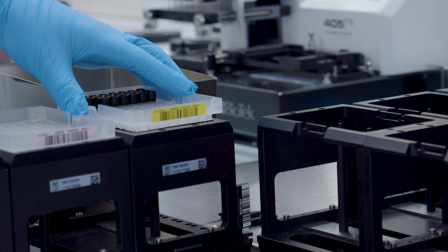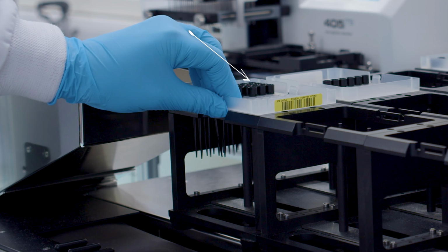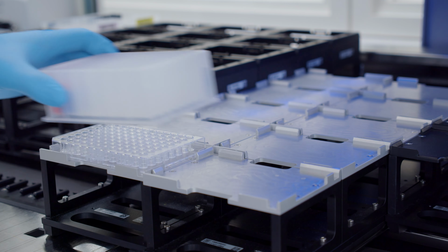Since the preview showed us how many tips we'll use, we don't always need a full rack, but the Hamilton will always take from the top left. Then load the output plate and input liquids.